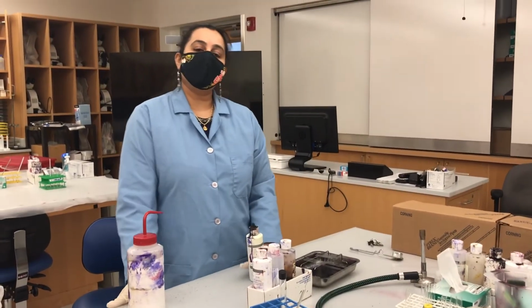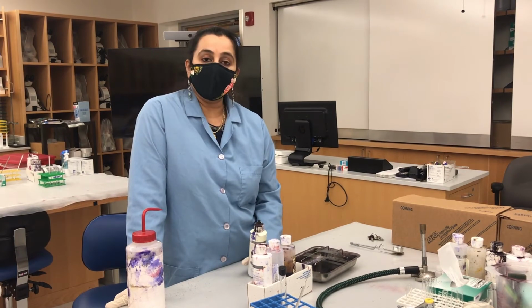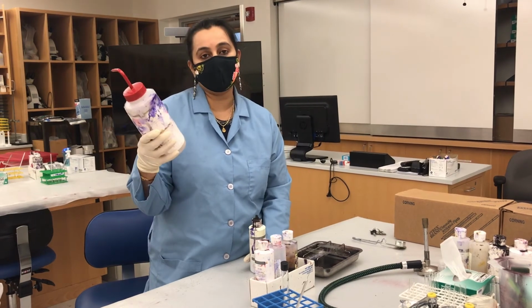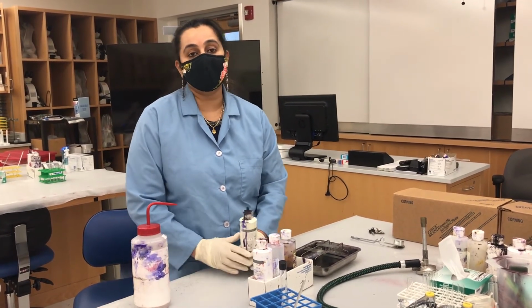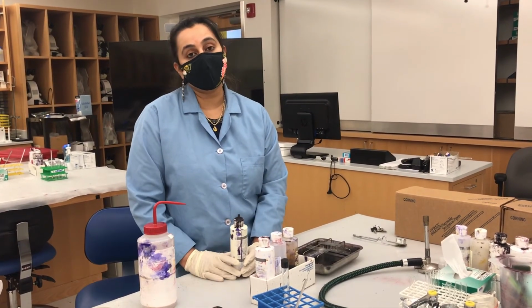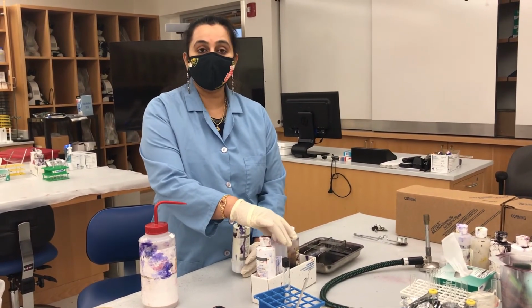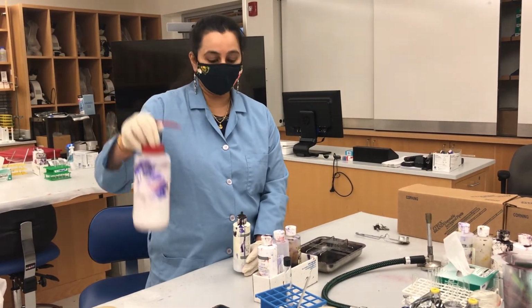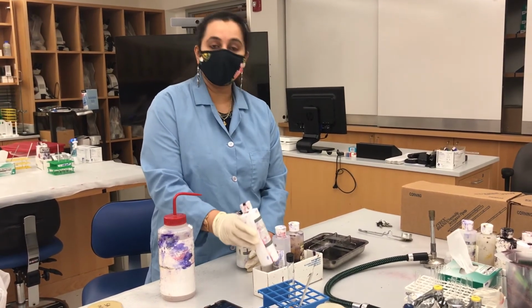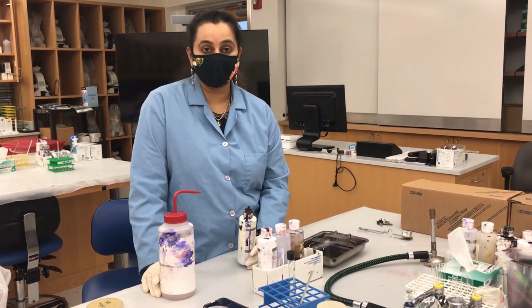Every lab follows a specific procedure, and here we follow 1 minute of the primary stain, followed by washing quickly with deionized water, and then we add Gram's iodine for a minute. We wash it with water. We add decolorizer for a very, very brief period of 8 seconds only. And then we stop the action of the decolorizer by again adding distilled water, and finally we add the secondary stain, which is safranin, for only 45 seconds. Wash it with water, and then it will be ready to be viewed under the microscope.